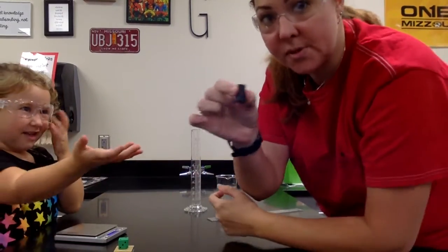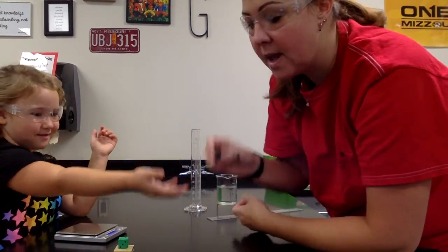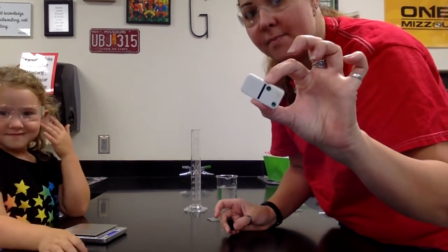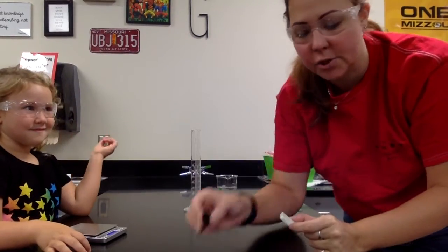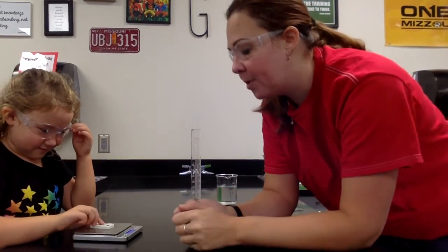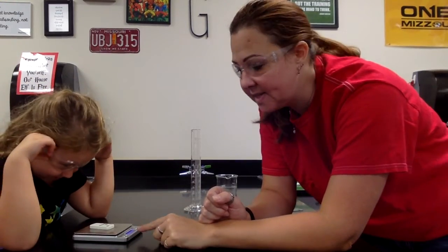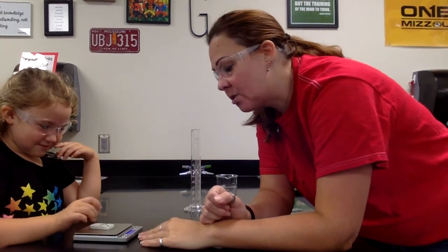So we're going to do the rubber stopper for our irregular shaped object, and we're going to do our domino for our regular shaped. We're going to go through the regular shaped object first. So first we're going to put it onto the balance. And when we put it onto the balance, it's going to tell me how many grams this is. This data is already on your lab paper. But this one says it's 13.96 grams.